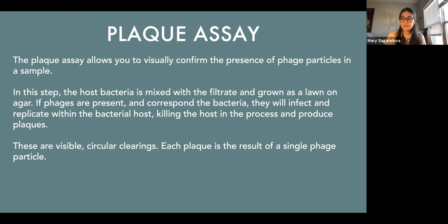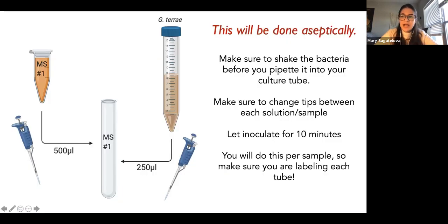Okay, this is not something you will see this week. It takes a couple days for these things to grow, so you'll see them next week as a way to confirm if you do or don't have phages in your sample. Okay, so let's break it down. How are we doing this?